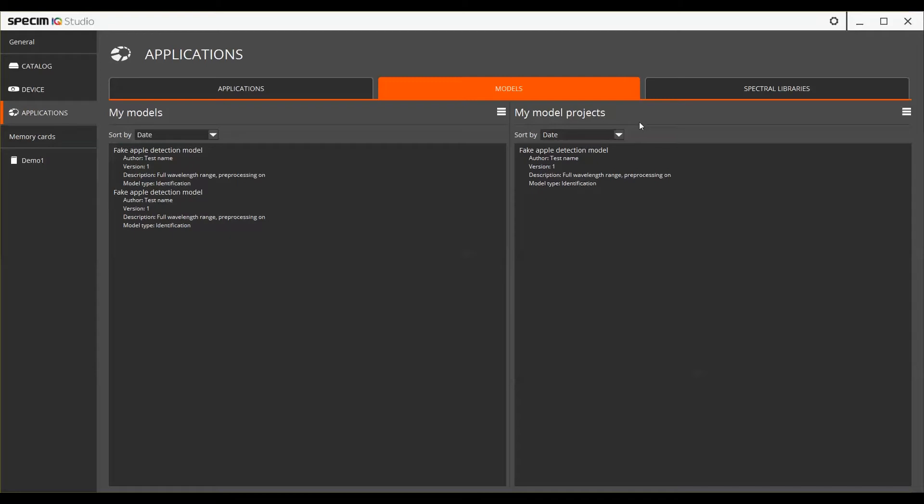In my model project list, you can see the model projects. These can be edited, whereas the ready models cannot be.